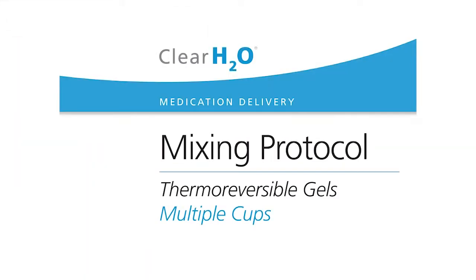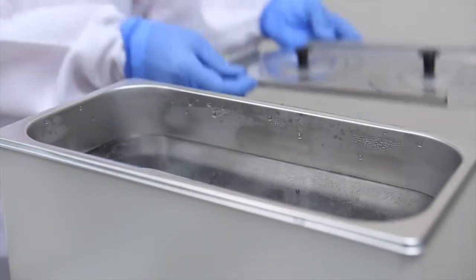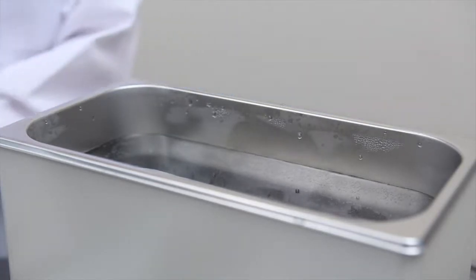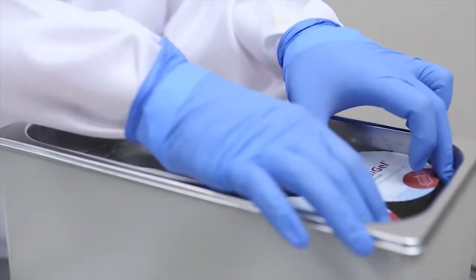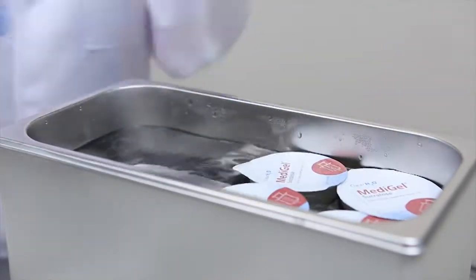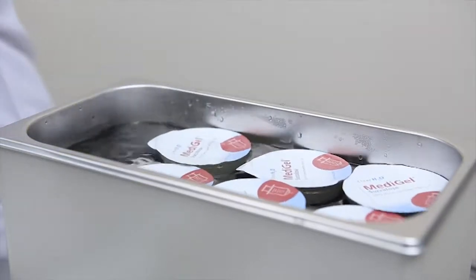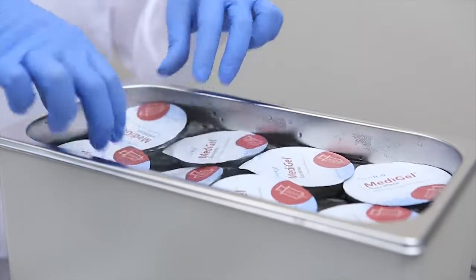This video reviews medication delivery mixing instructions for thermoreversible gels for multiple cups. Water baths come in a variety of shapes and sizes and can accommodate varying numbers of cups at one time. The standard water bath demonstrated here can hold eight cups at once.